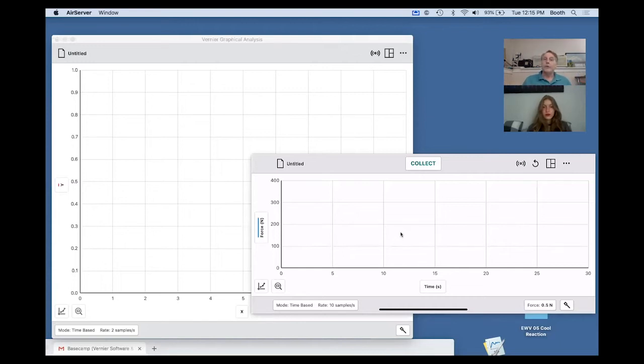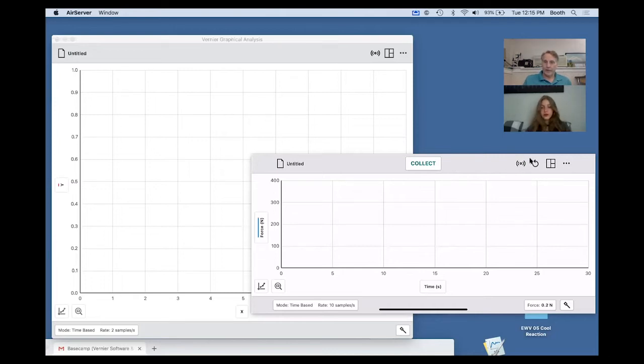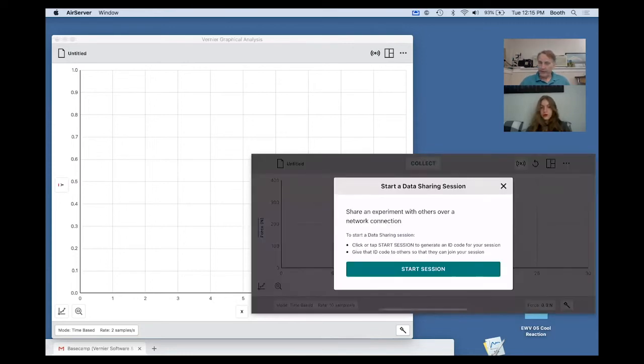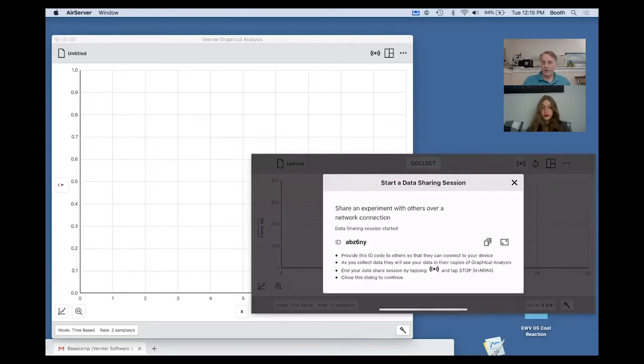What I need to do is start a data sharing session. The way this works is that on my phone, you'll see the little icon right here, and when I tap there on the phone, it says start session, and so I'm going to tap start session.